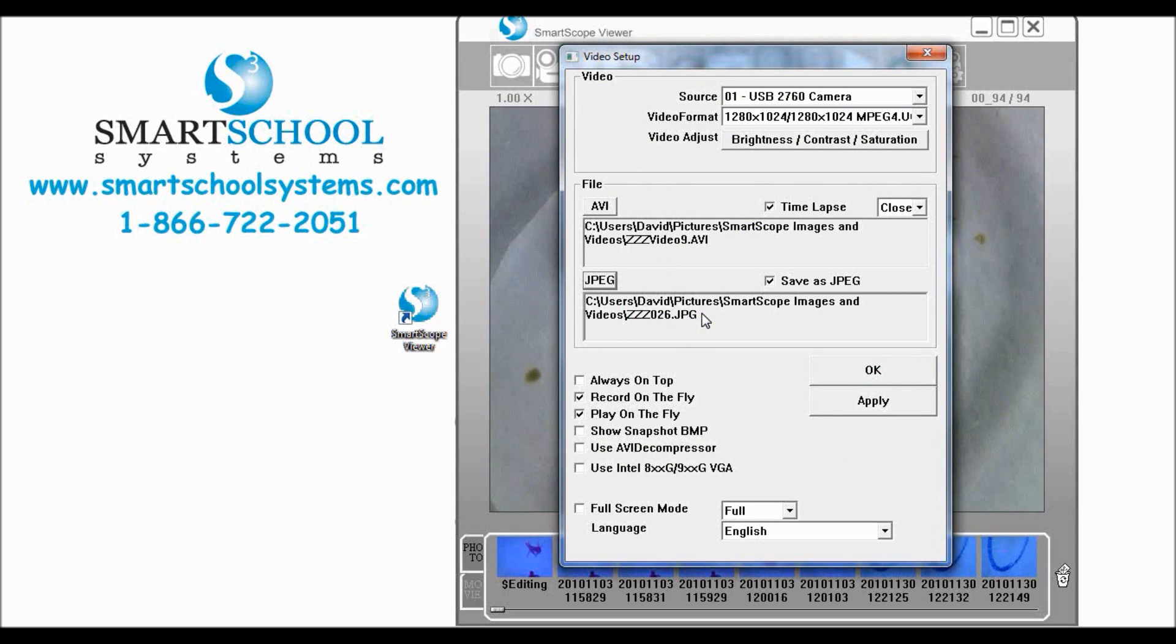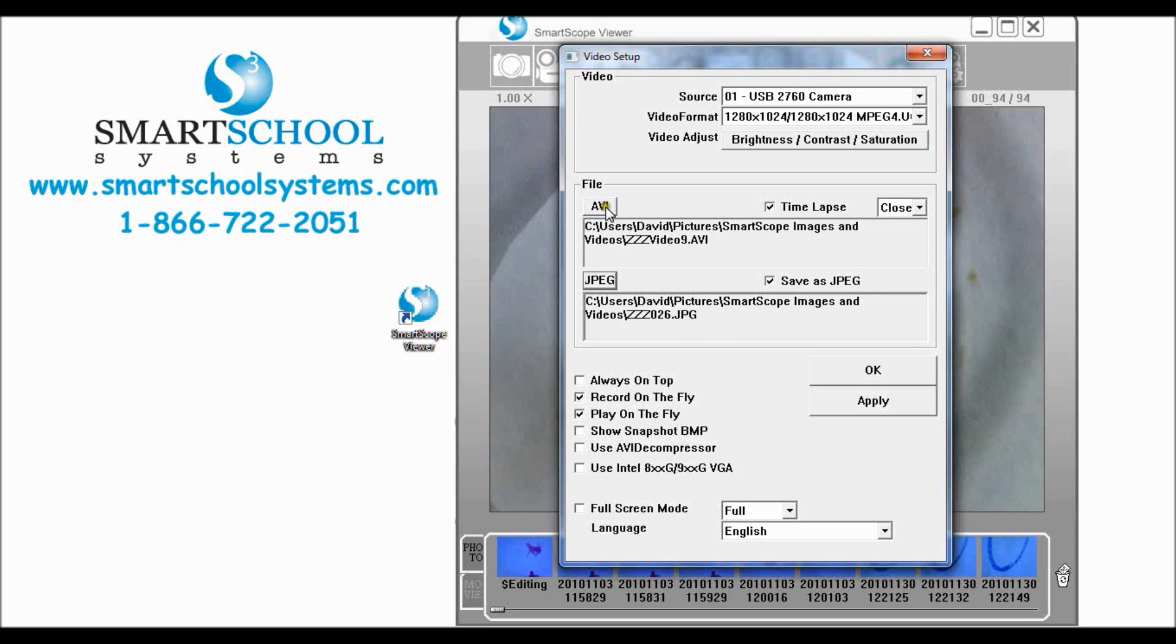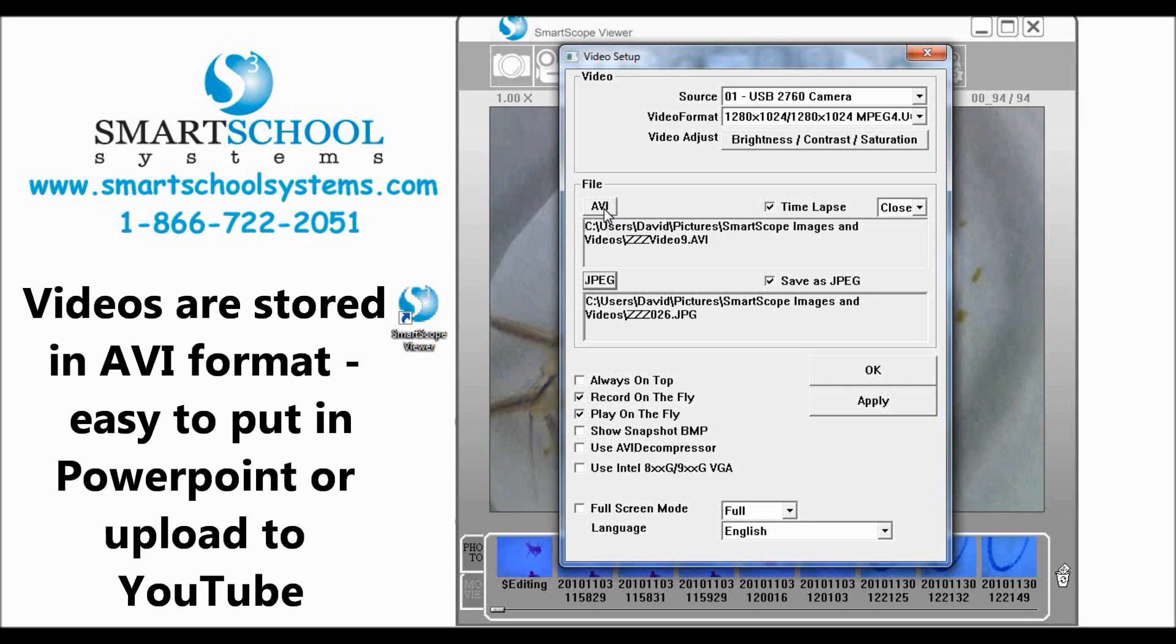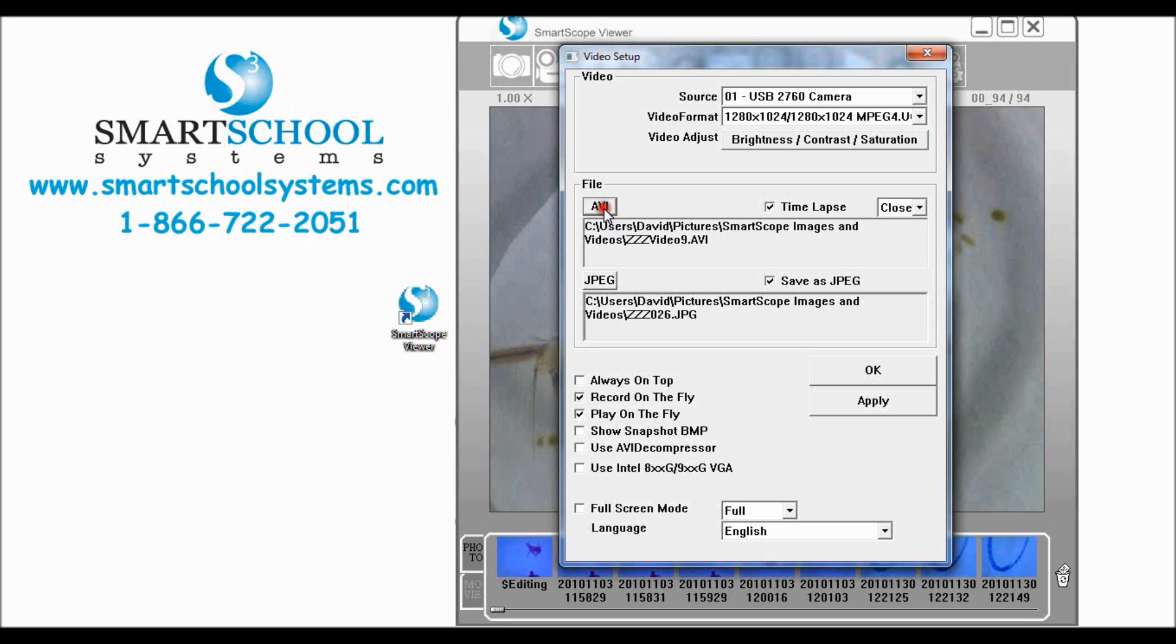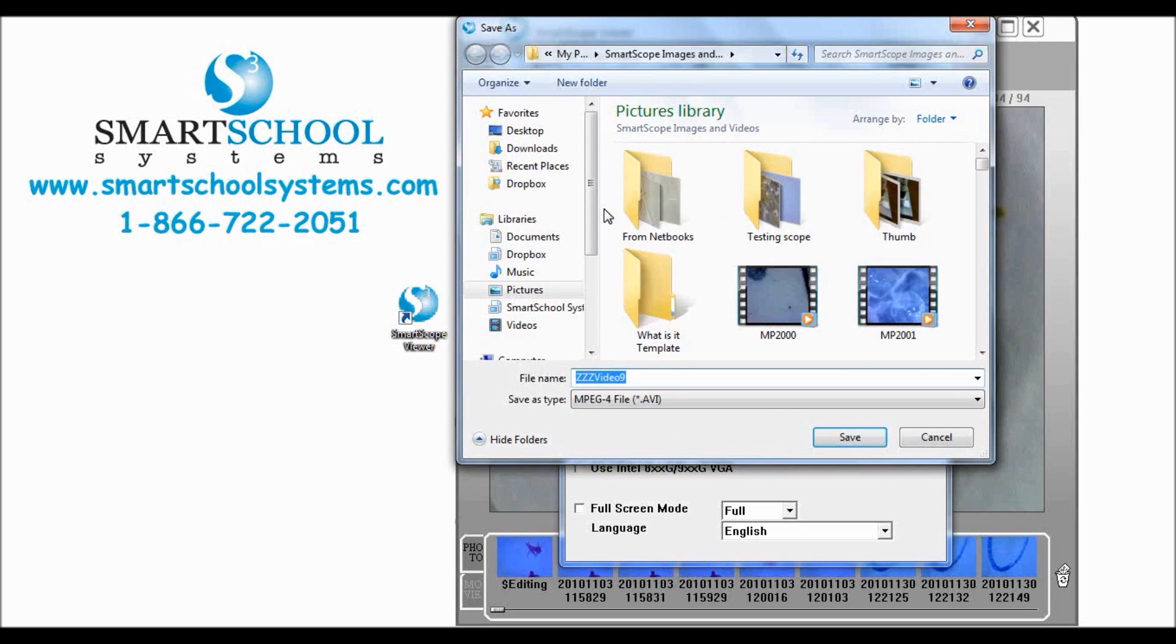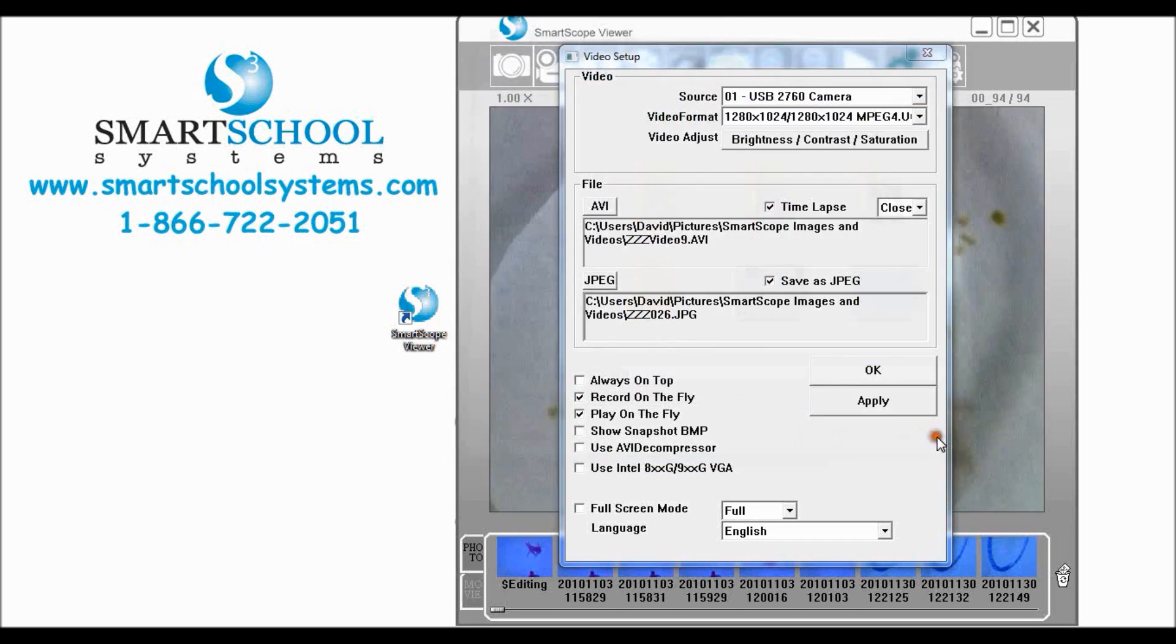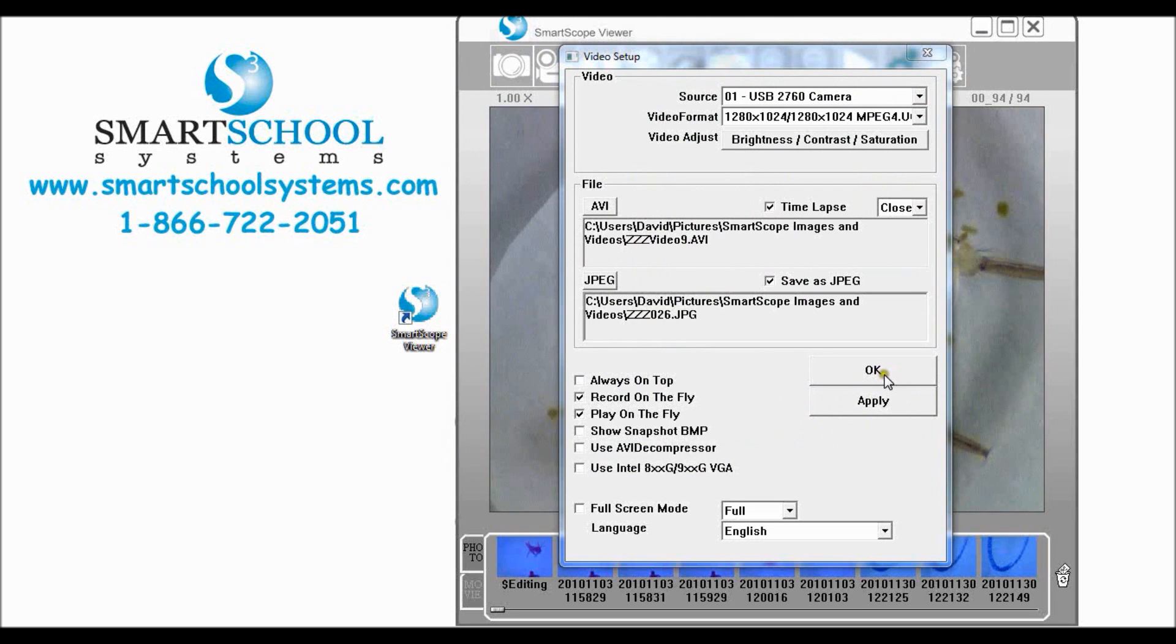Same thing with your videos. Your videos are stored in AVI which is a standard format, can be dropped into PowerPoint, can be uploaded to YouTube, those types of things. If you want to redirect where those are stored just come in, tell it where you want to store it, click save and it stores all of your future videos there.